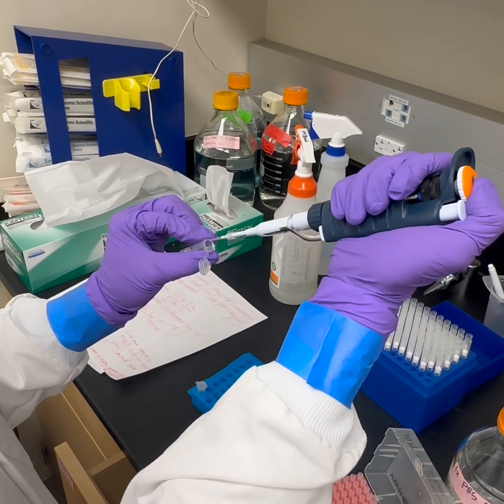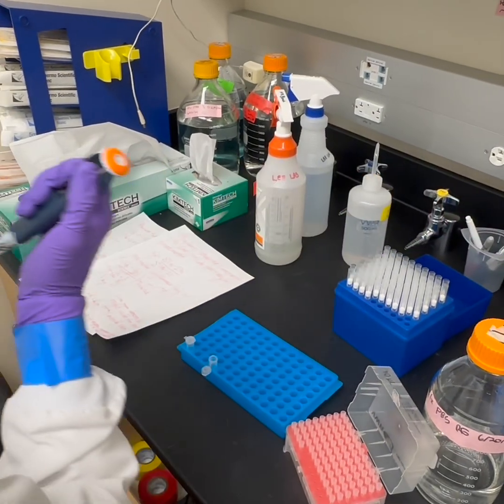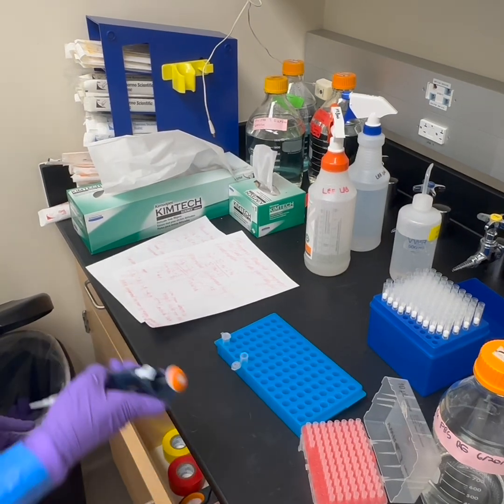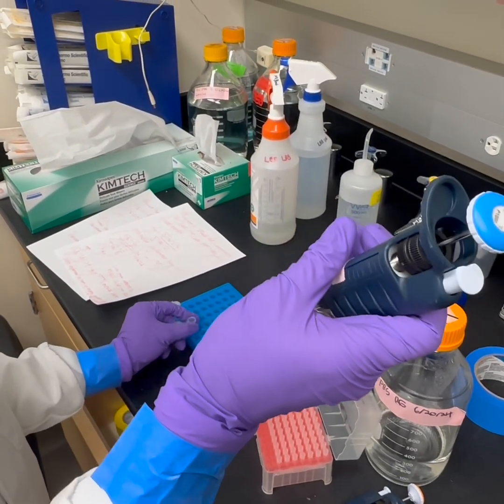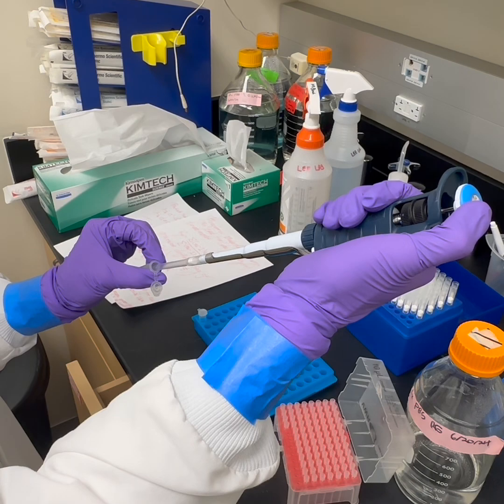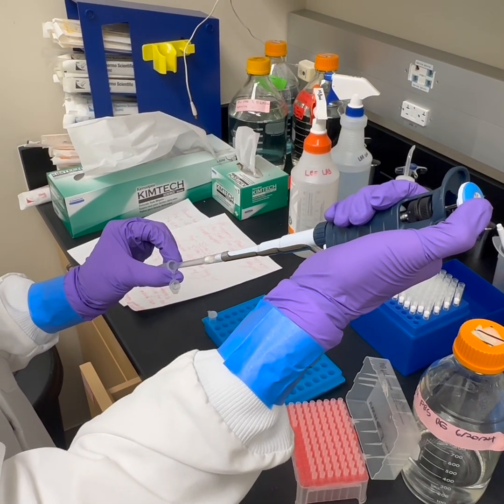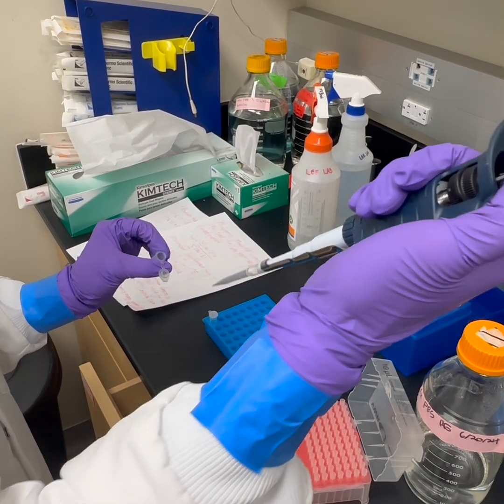All right, pretty well mixed. Okay, and then you'll take your pipette that you saved from earlier and make sure the mixture is homogeneous. Excellent.